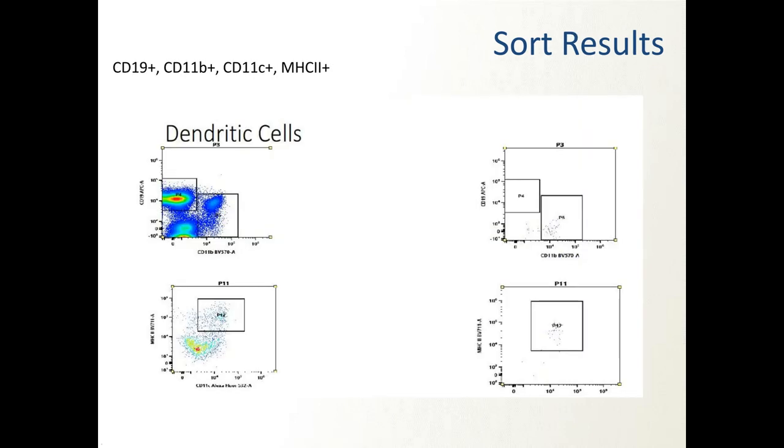And here are the ones I didn't show in the original presentation. So here we took the dendritic cells. We didn't really have that many. And if we look at them on CD11b versus CD19, sure enough, there they are. We're getting no B cell contaminant, so the sort's working. These are cells that are just probably starting to die a little bit. You can also look at MHC2 and CD11c, and sure enough, we still see the same relative distribution. I believe that sort worked. I just believe there's not enough cells in it to make a really pretty picture, but from a functional sorting point of view, that totally worked.